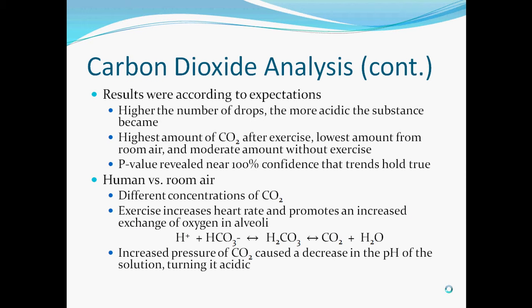So the way we measured how much carbon dioxide was in the solution is essentially the higher the number of drops you have to put in to return the solution to a base, the more acidic the solution was in the first place. And the more acidic, the more carbon dioxide content.